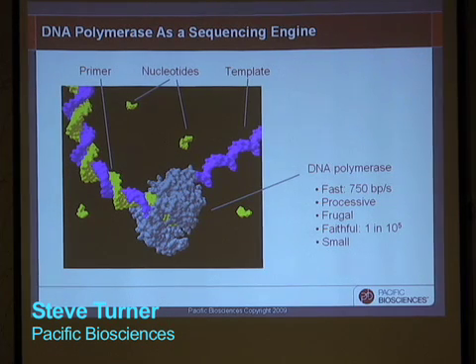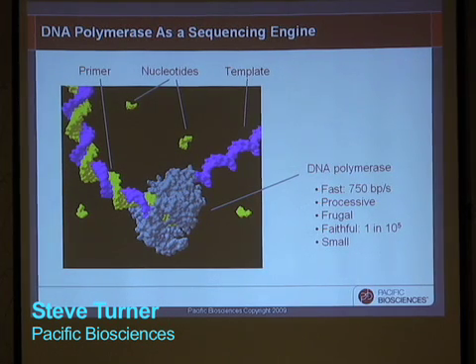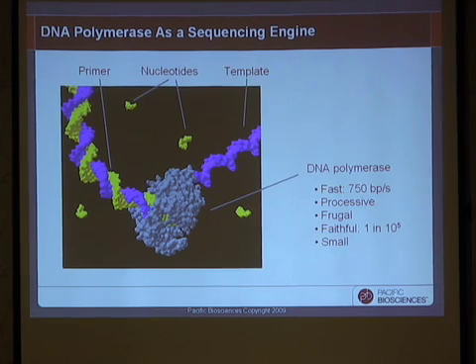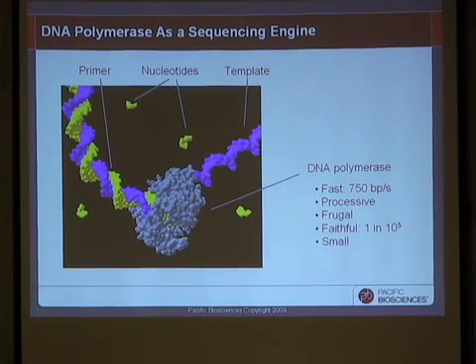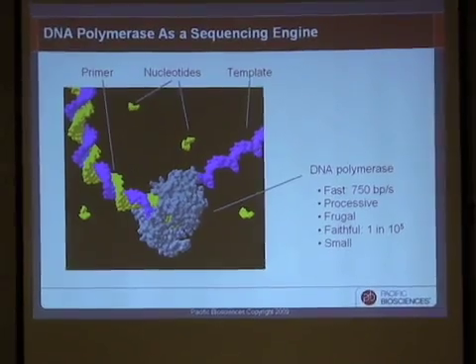And we think of it at Pacific Biosciences as a sequencing machine in and of itself, a nanorobot, if you will, that every time a cell replicates, searches across the genome, visits every base in sequence, and identifies those bases, records the information in the complementary strand, and as such, it is a sequencing machine. Now, it has a problem for us, technologically, which is that we don't know how to read its, that is, after all, the complementary strand, every bit as difficult for us to read as the original. But if we forgive it for just a moment, that one shortcoming, look at its performance here.